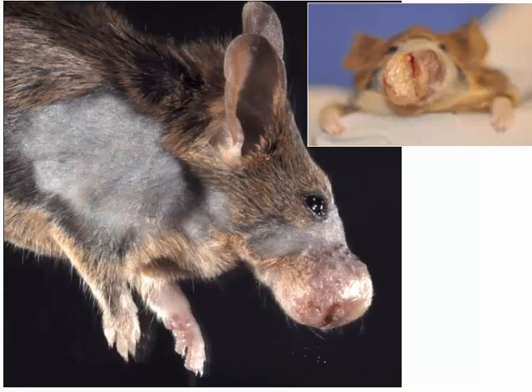Botryomycosis comes from the Greek word for grapes, and was named this way because on cut section it has this sort of proliferative response with foci of bacteria which are encased with brightly eosinophilic material. Some people call it Splendore-Hoeppli material. It actually is aggregated antigen and antibody complex that the body throws at these bacteria. It has trouble clearing them. In order to encapsulate them, there's a profound chronic response, and these particular lesions continue to grow.